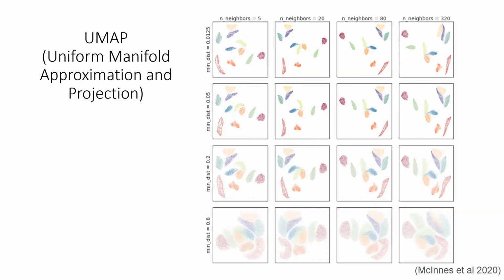So the point I'm trying to convey here is that t-SNE and UMAP are only used for visualization, just to give some intuition about what the distribution of genes looks like across your samples. It's really not appropriate to use them as a basis for any quantitative analysis. So to compare differential gene expression across groups, that's often done in the raw gene expression space.